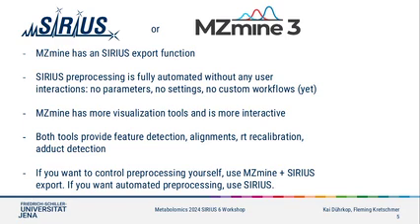So I would say if you want to invest time in your analysis and specify parameters because you think my workflow has very specific parameters I want to control, then use MZmine with the SIRIUS export. Otherwise, give just the SIRIUS preprocessing a chance because basically it contains all the functionality which is also in MZmine in the preprocessing, like adduct detection and so on.